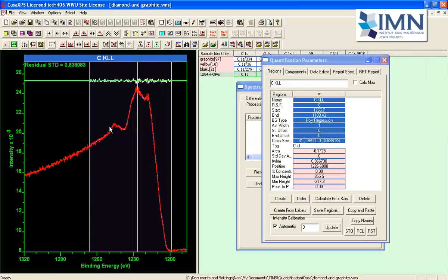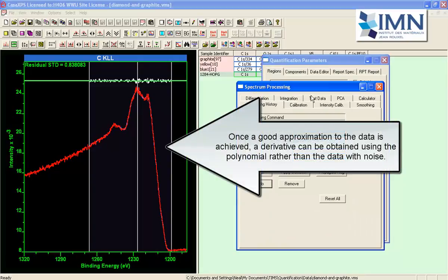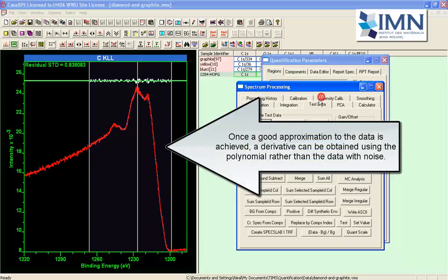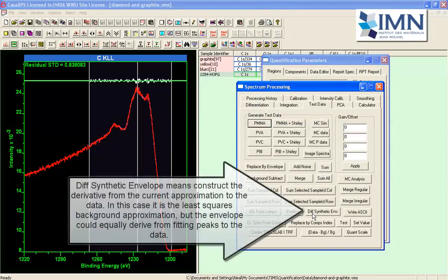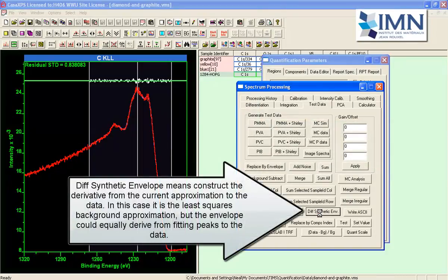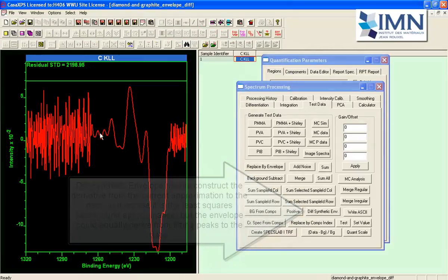So this is now a reasonable approximation to the data and having done so I can use an option on the test data tab which says differentiate synthetic envelope and when I press that button I end up with a derivative.